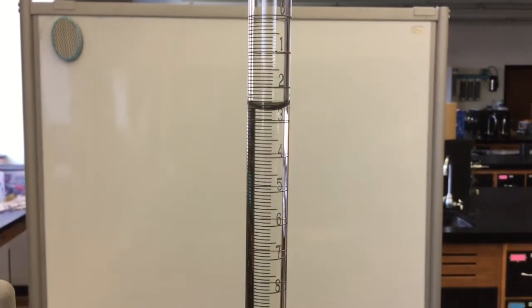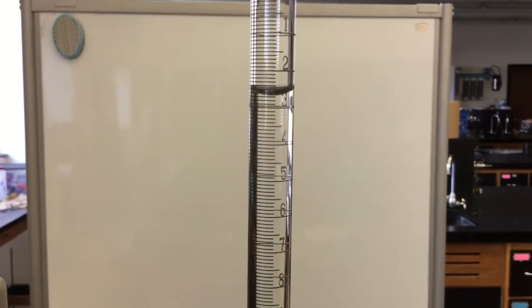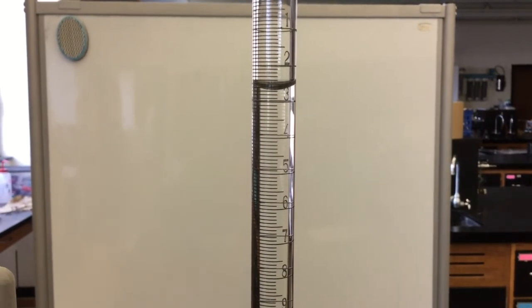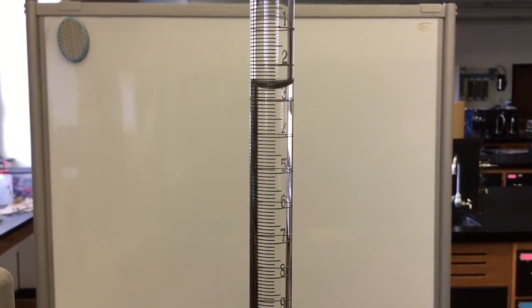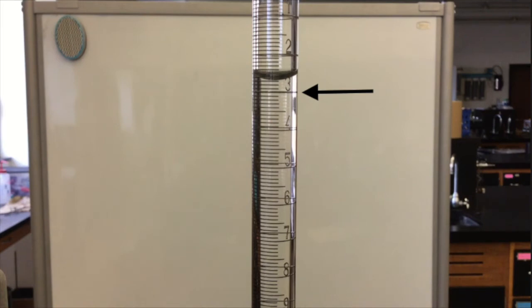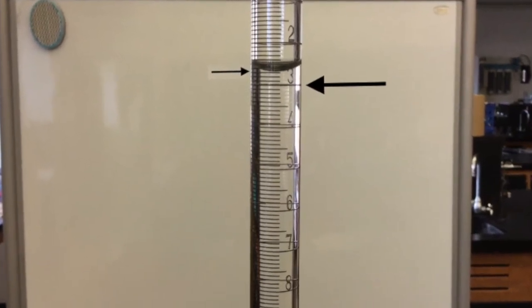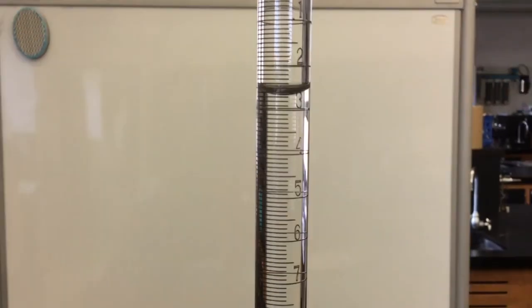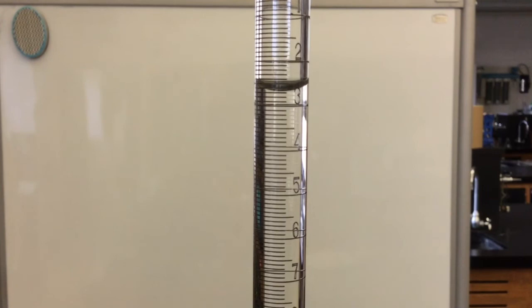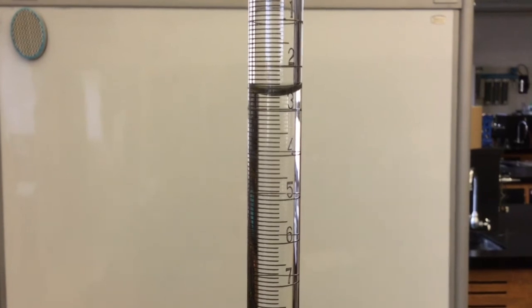I find it helpful to get the lines that go all the way around the burette to overlap with one another to know that I am looking at the measurement straight on. Remember to read at the bottom of the meniscus and remember that the numbers go from low numbers at the top to high numbers at the bottom. Record the measurement in your lab manual to two decimal places.